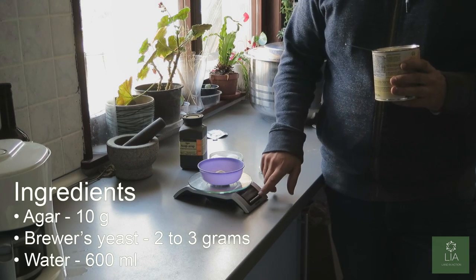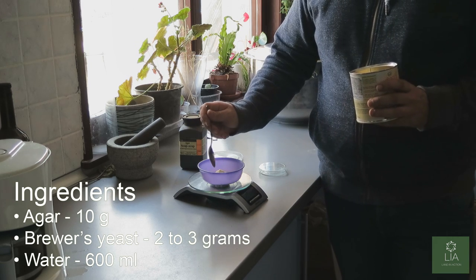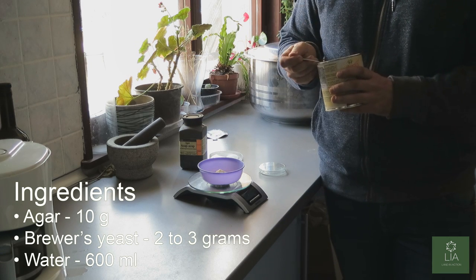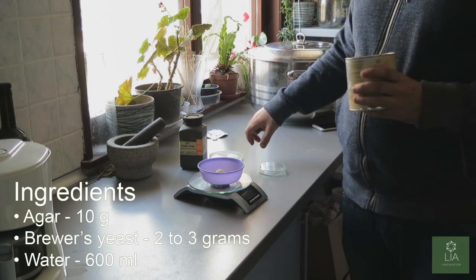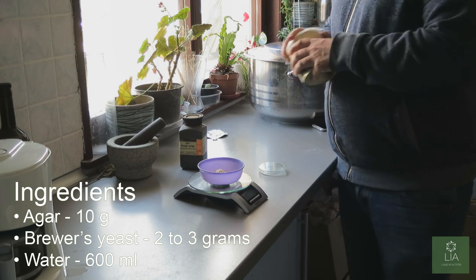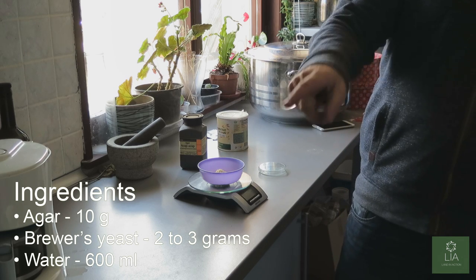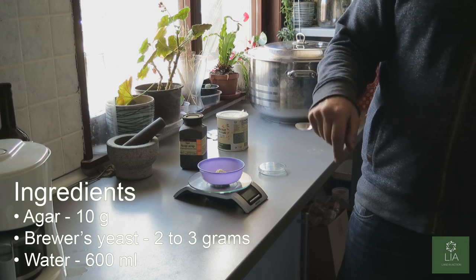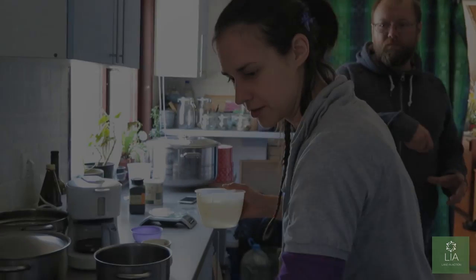So, we have 10 grams of agar in here, and we're basically going to put 2 grams of yeast, or well, 3 grams of yeast, it doesn't really matter, it's going to get cooked anyhow. So that's it, now we'll put that into the pan, add some water, boil it up, and then we'll put it into the jars.